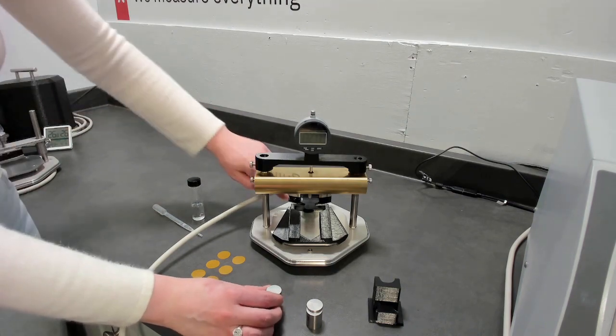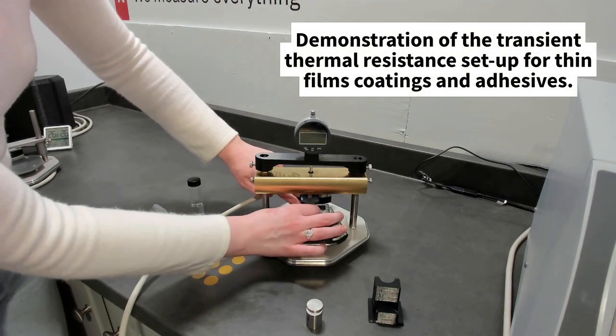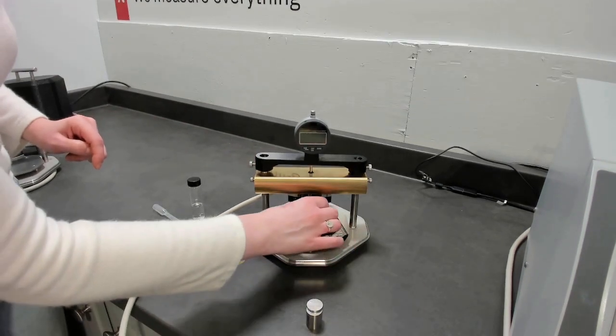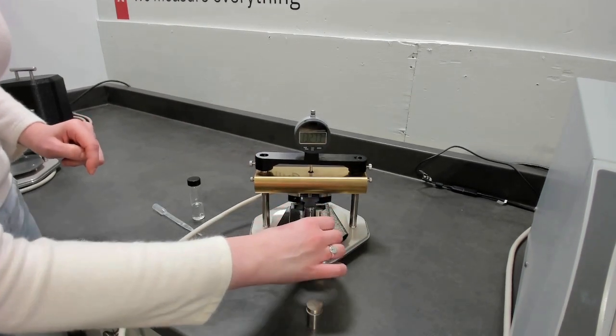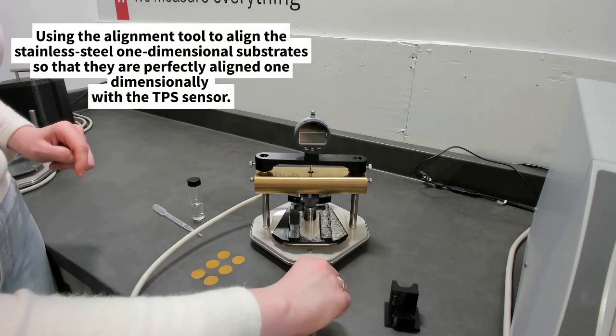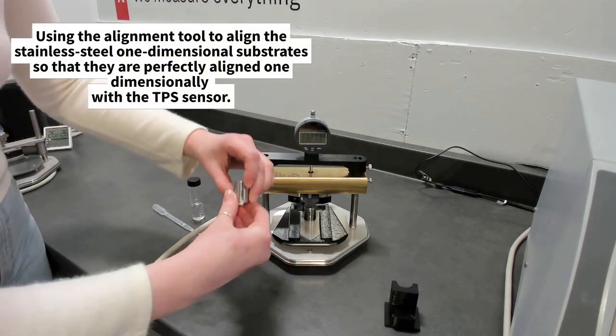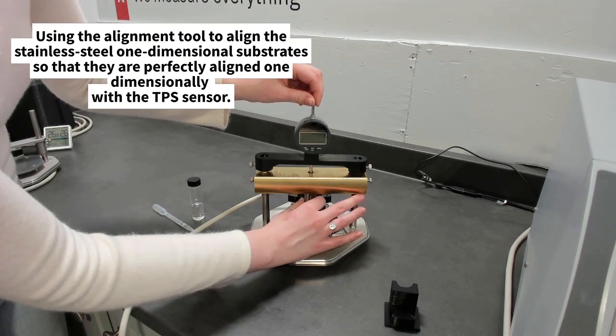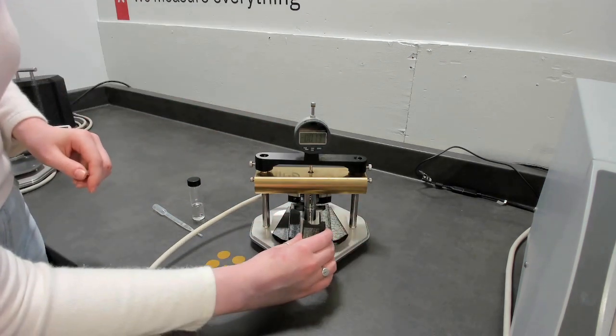This is a demonstration of the transient thermal resistance set-up for thin films coatings and adhesives. We're using the alignment tool to align the stainless steel one-dimensional substrates so that they are perfectly aligned one dimensionally with the TPS sensor.